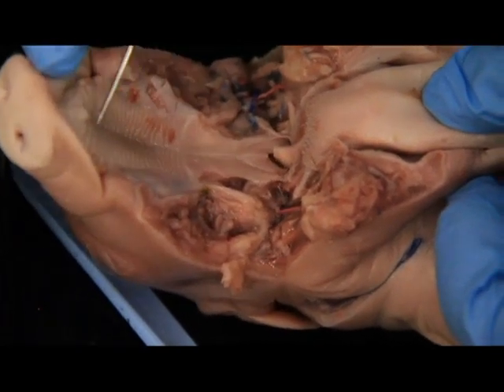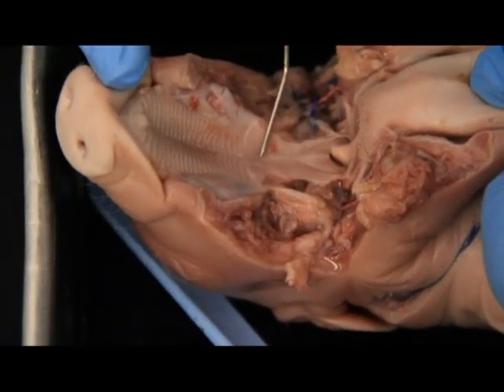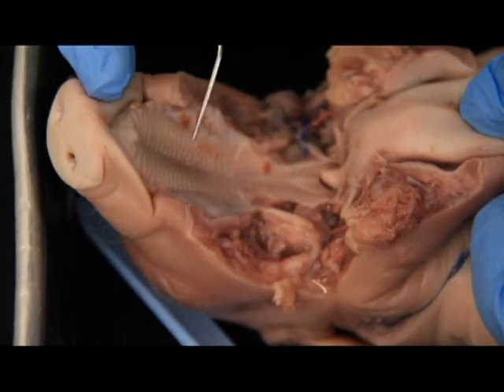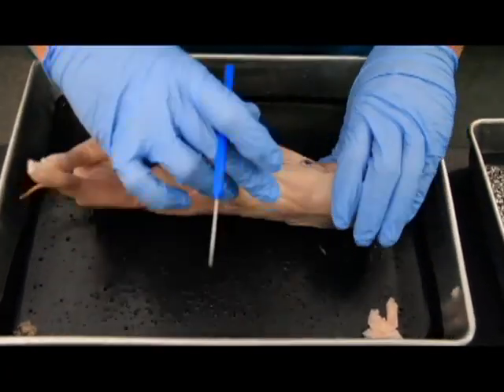And then in the top of the mouth, the roof of the mouth right here, you've got your soft palate right here, and your hard palate up here. And you can feel this one's very hard, and this one kind of gets nice and soft right back here. Okay, so we're all done with the mouth, we're all done with the cheek. The next thing we're going to work on right here is the throat.